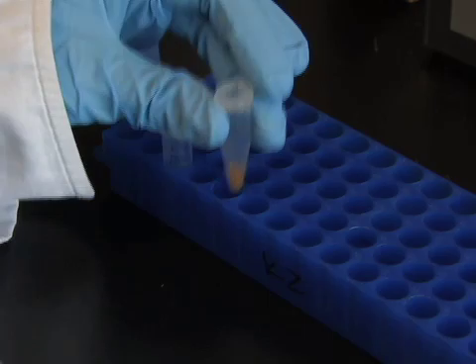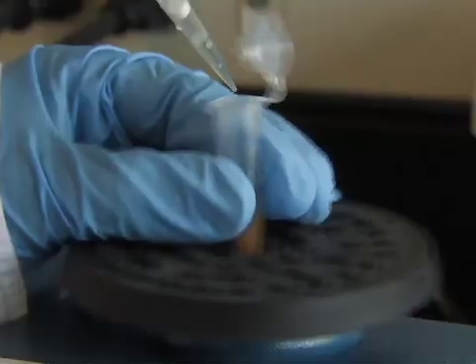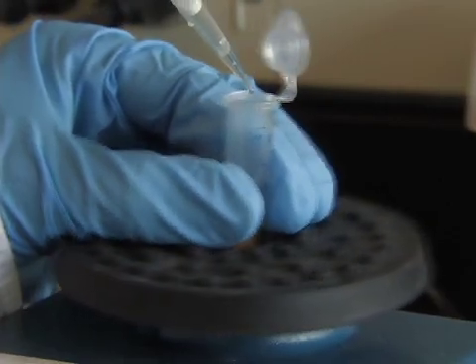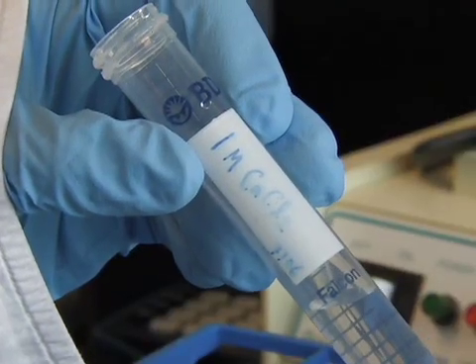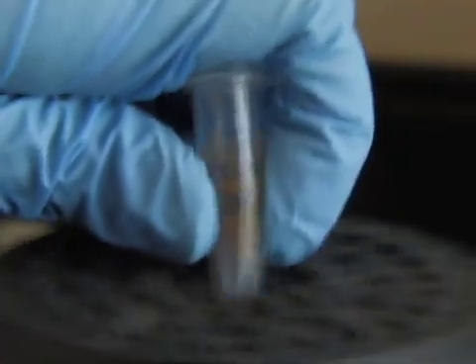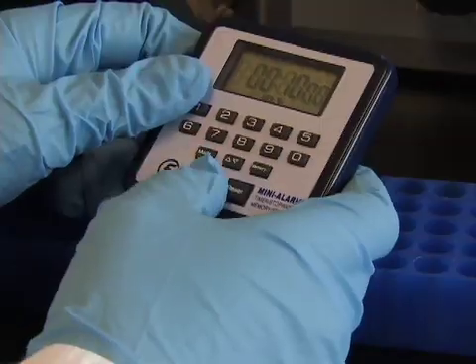Once the DNA has been added to the beads, vortex while adding 100 microliters of calcium chloride drop wise. Calcium chloride causes the DNA to precipitate. After a brief vortex, allow solution to precipitate for 10 minutes.